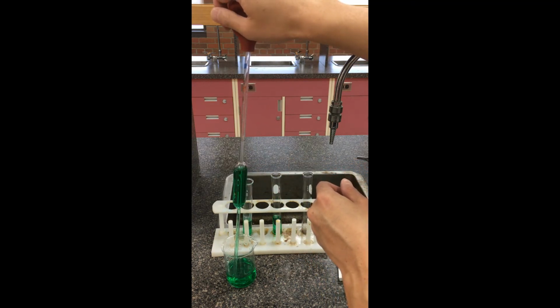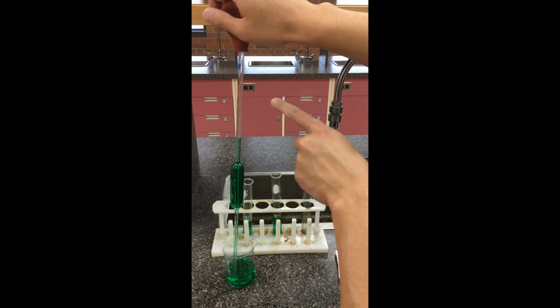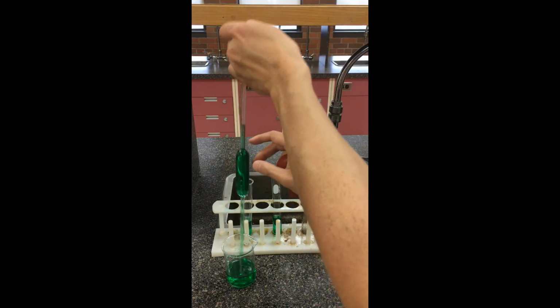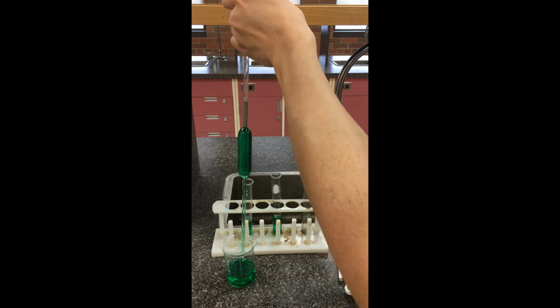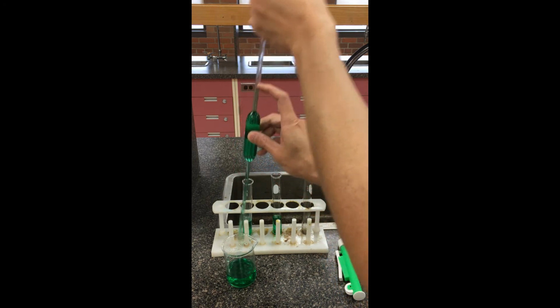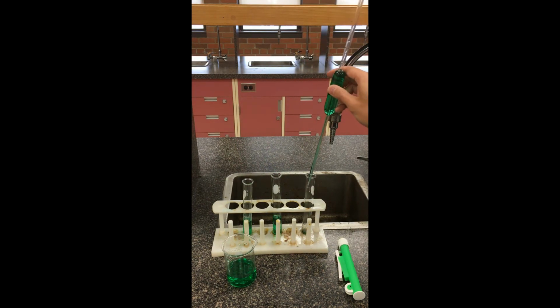Again, what you're going to want to do is go beyond that mark here. We can quickly take off the bulb, put it on your finger, and again, you're just going to wiggle your finger until it's back to that mark there. When you're confident that it's at that mark, again, you can just let it go. This aliquot here will be a little bit more volume than the other ones, but that's how we deal with the 25 milliliter pipette. I'm just going to demonstrate one other thing here. I'm not sure this test tube, oh, just filled 25, perfect, okay.